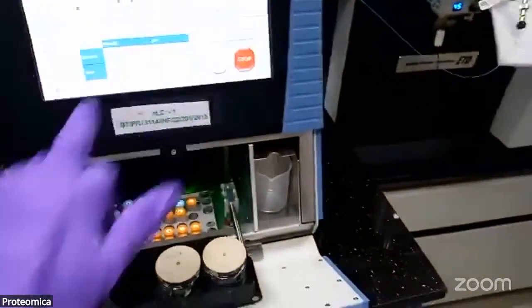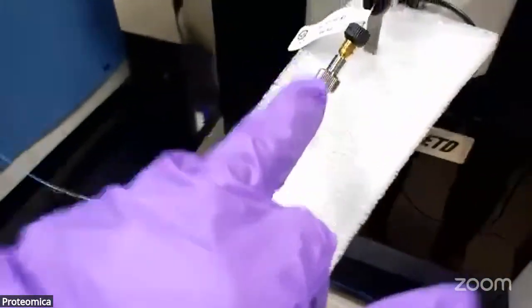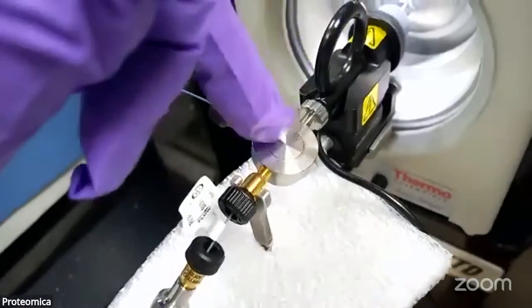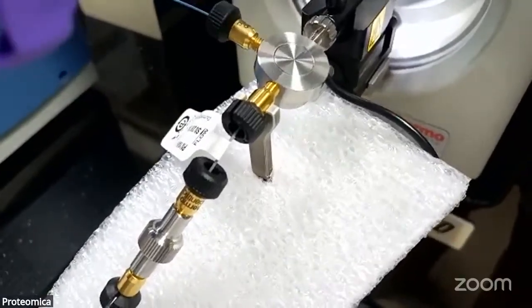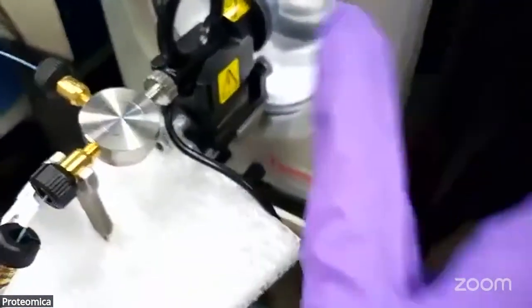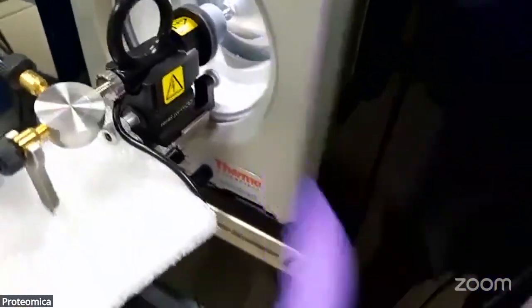So once the sample has been injected from the nano LC, it is diluted and comes to the trap column. In the trap column, which is a pre-column, if there are certain impurities, the samples may get cleaned there. Otherwise, it goes to the main column. This is our elution column, or the analytical column, or the nanospray column, which is generally a C18 column. Here the actual separation happens based on hydrophobicity and hydrophilicity, whatever gradient we apply. The sample then goes inside. What you can see is the source, where the electrospray ionization happens. And from here, it generally goes inside the system.